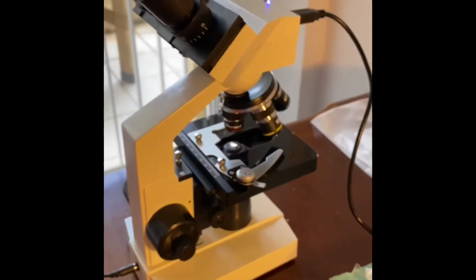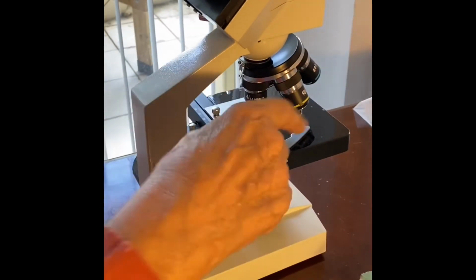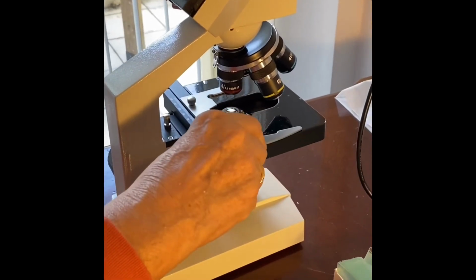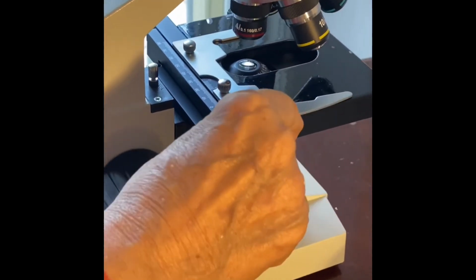Okay, so we now may look at the mechanical slide holder. It's on the stage. As you can see, it's here on the stage, and there's a little lever on the right that opens it up so you can put the slide in.